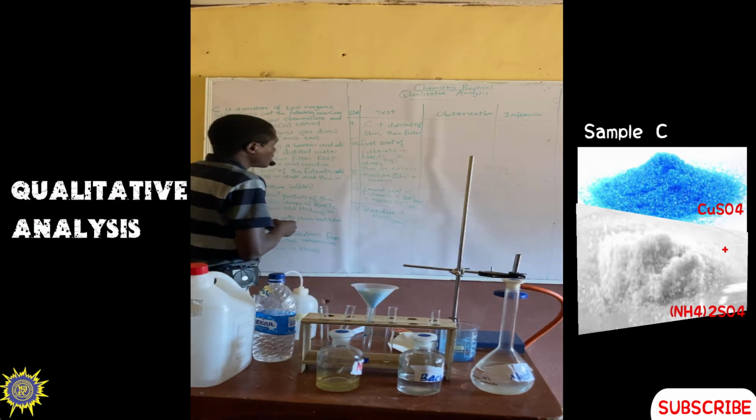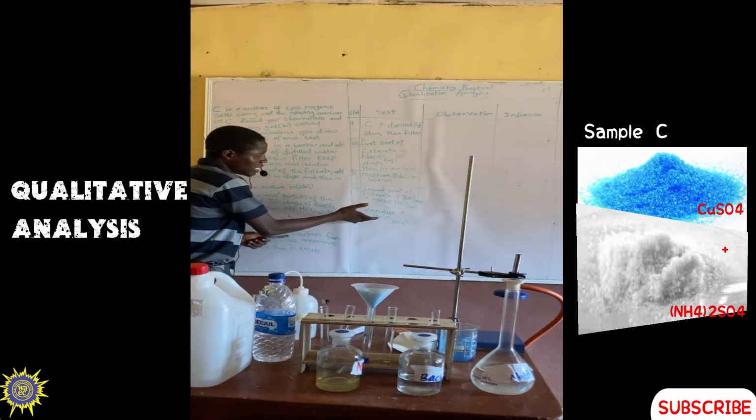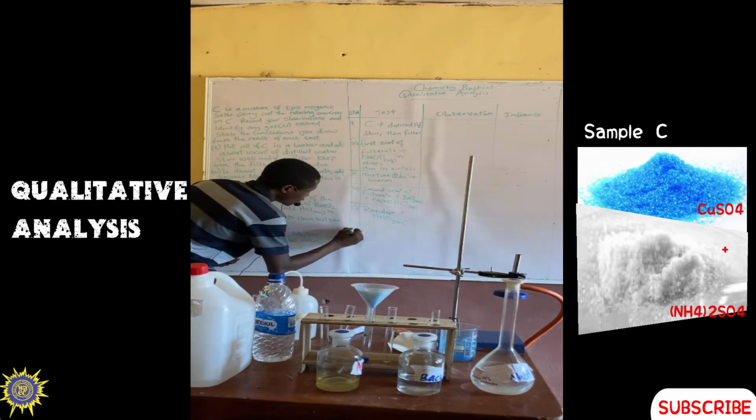Another thing that we also have here is a portion of the solution from 2CI. Whatever you obtain here, you divide into a portion. You take the portion, so C Roman figure 2 here.